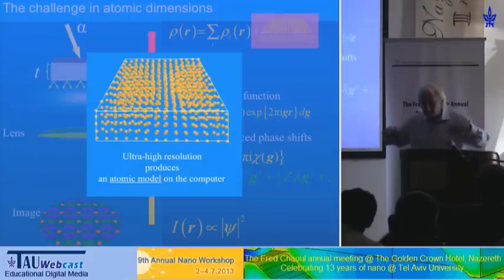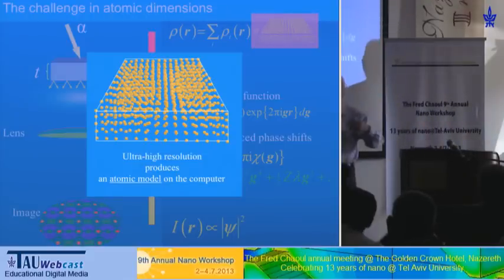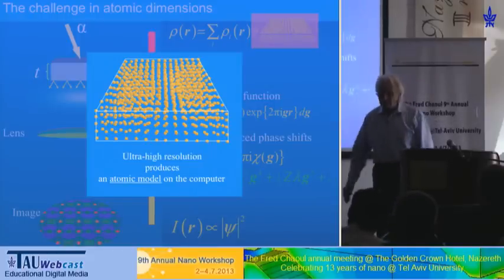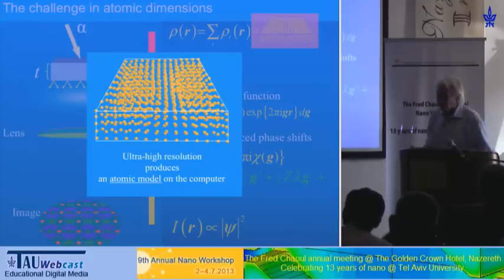So we have, as a result, the model, and now I give lectures to you, and so if I would be a simple-minded person, I would give you a table of atomic positions, and that's quite boring. X-ray people publish long tables and so on. But we have an imaging instrument, so you expect an image.